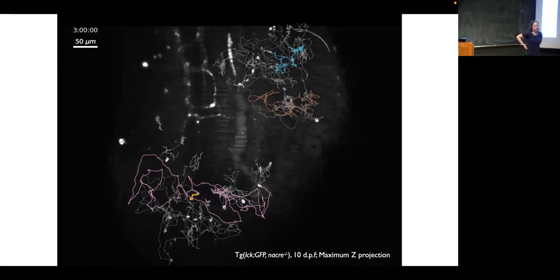Sorry. The question was, do we immobilize the fish in the same position? Yeah. It is far, far harder to do microscopy on a moving organ.